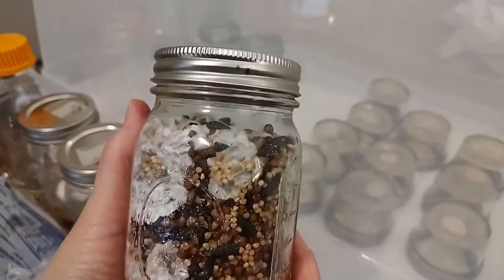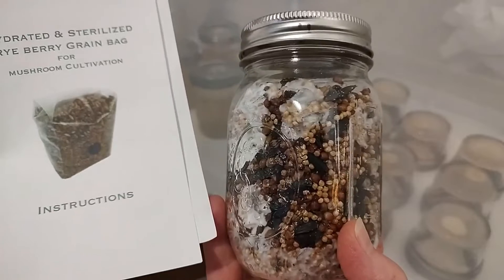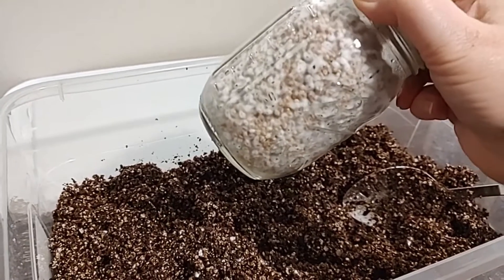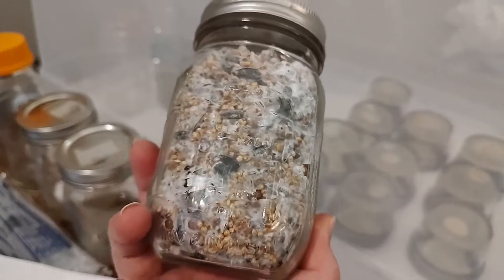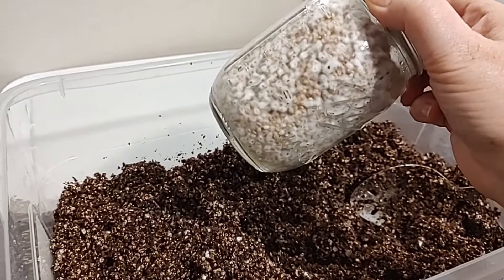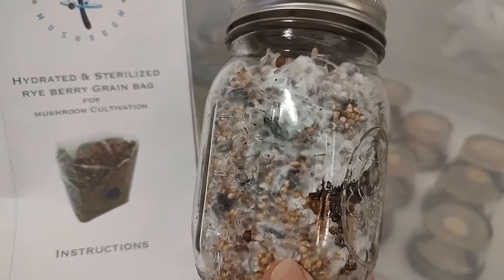After it colonizes — whether it's in a jar of bird seed or grain, called a WBS jar (wild bird seed), or a bag — it doesn't matter; it's the same process. When it's all white, what you really want is rhizomorphic growth. Tomentose is fluffy; rhizomorphic is more antler- and branch-like. A lot of people get confused and think tomentose is mold. The rhizomorphic growth is more branch-like and antler-shaped. Once it's colonized and completely thick white, whatever vessel you choose, you're going to move it to substrate.